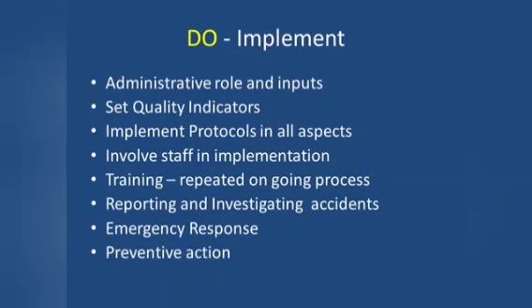Implement your safety policy. Now the administrative role would be giving the laboratory safe space, adequate storage facilities, providing protective gear, post-exposure prophylaxis, etc. Administration and the safety committee should review the quality indicators at regular intervals.